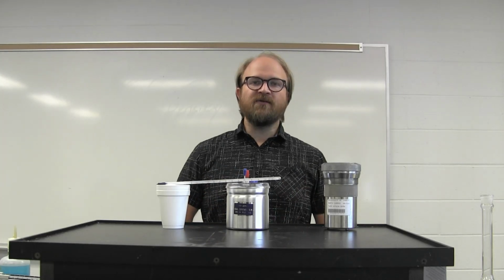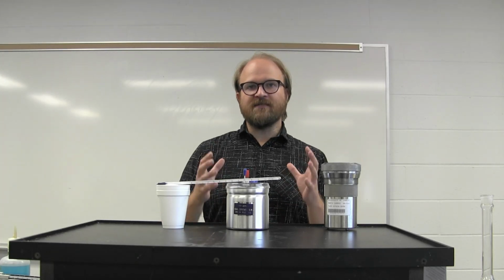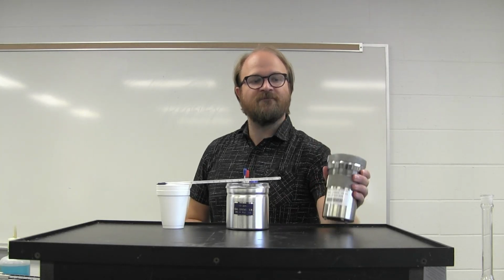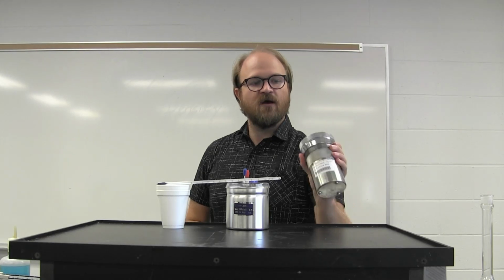And others are adiabatic, which means all of the energy is contained within the calorimeter itself, and there's no transfer to the outside surroundings. Things like a bomb calorimeter are a very advanced way to do this.